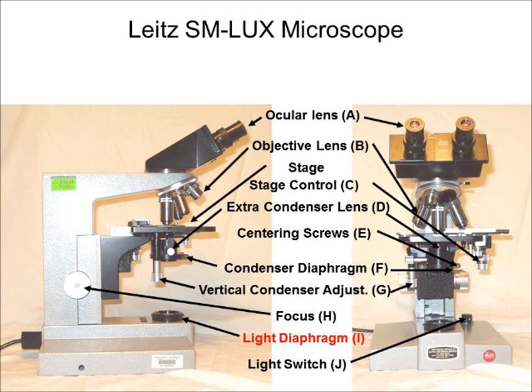On the bottom of the microscope you will find the light source that contains a light diaphragm — not to be confused with the condenser diaphragm. This can be opened and closed by rotating the outer ring, and it regulates the amount of light going into the condenser.